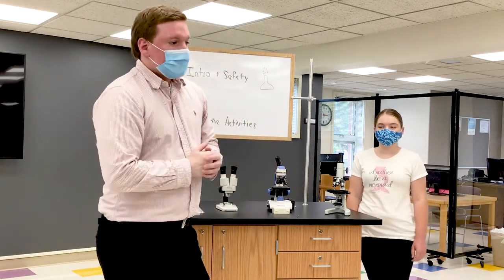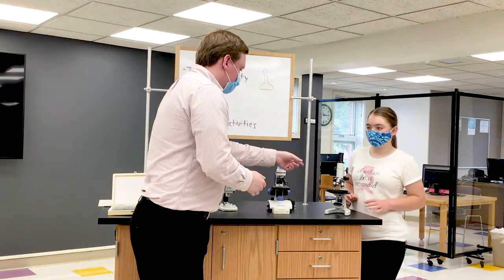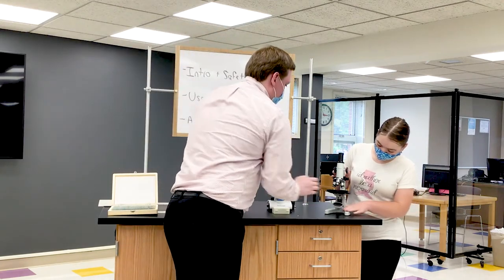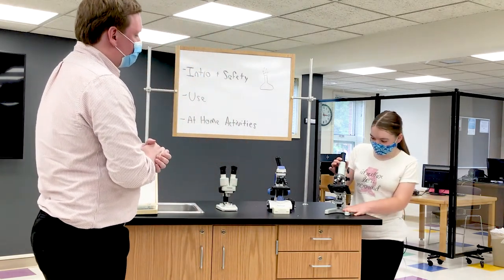So it's very important — if, say for example, your child's looking at the sample and then you come in and look and it's blurry for you, don't be confused. You can just use the fine focus, that's why it's there, to adjust it for your own eyes. The arm is actually adjustable. You see how it's upright? You can actually hold down the stand itself and then pull back on the arm right here, so you can angle it a little bit better for you.